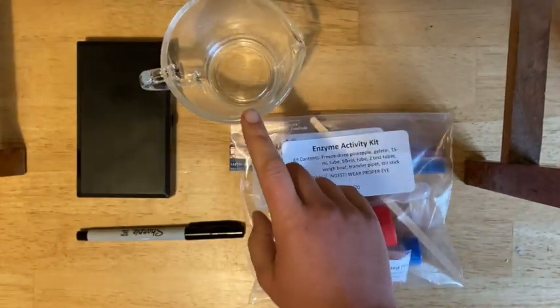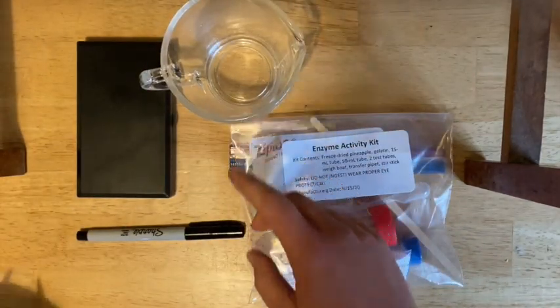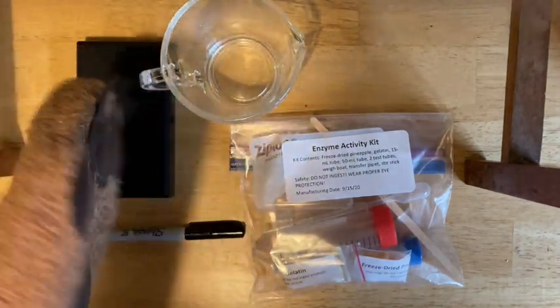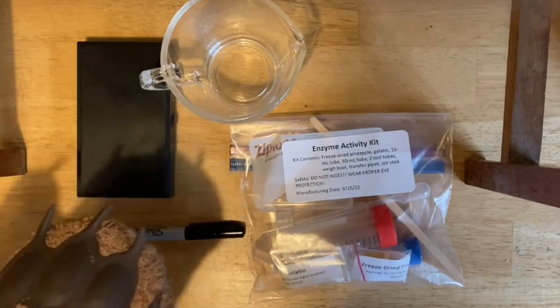No metal — make sure that it is a microwave-safe container. You also need potholders of some sort because you are going to be microwaving liquids and making them hot.